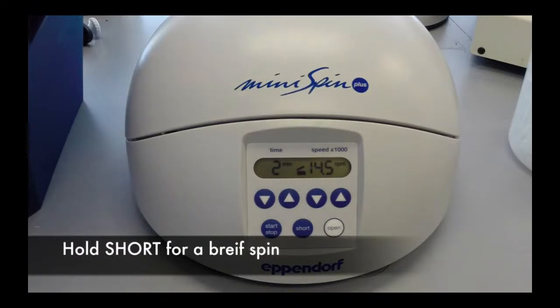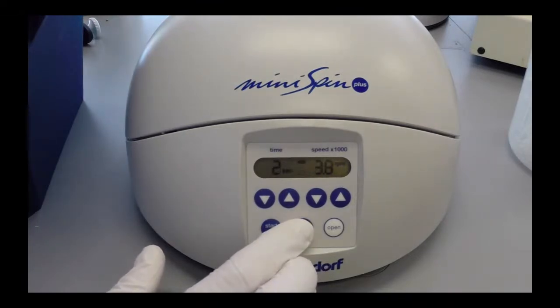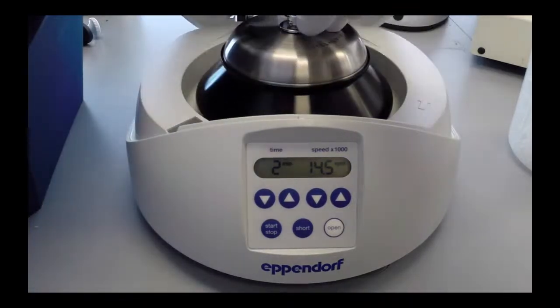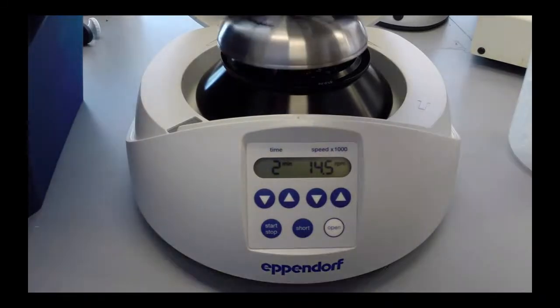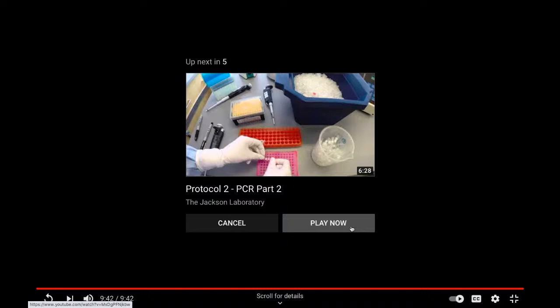Press and hold the short button to do a brief spin. That's the last part.